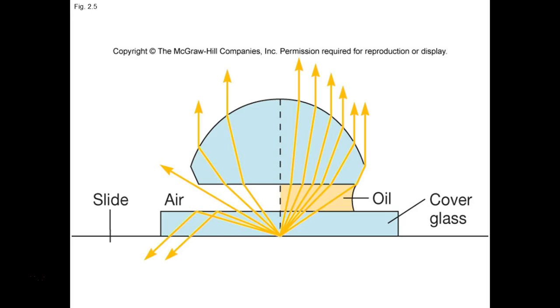So all the time in microbiology lab, students are like, "Miss Eric, I can't see anything." I'm like, "Yep, I know it. You know why I know this? Because I can see the gap between the slide and the oil objective lens. If there is a gap, you're not in focus. You're not anywhere near in focus. If it's almost touching the slide and the oil is filling the gap and you actually see the light get bright, then there's a possibility you're going to get there. The other way, not going to happen. Not for what you're supposed to be seeing anyways. Maybe looking at dust or something else, but you're not seeing what you're supposed to be seeing. Make sense?"